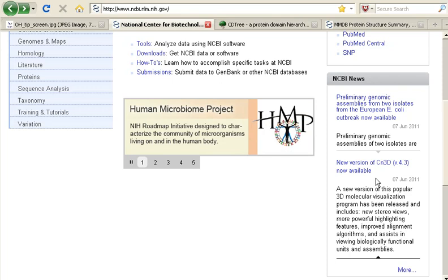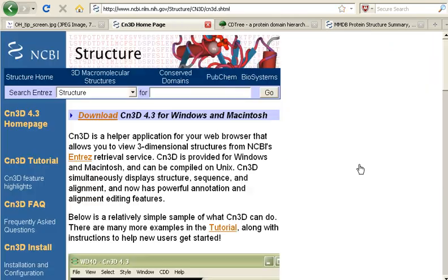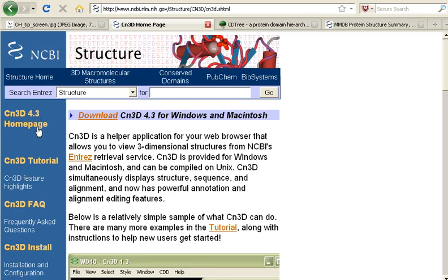That's what I'm going to talk about in today's tip. If you are at the homepage, you can click the header of that news item to access the CN3D 4.3 homepage, which is within the NCBI Structure Group of Resources.